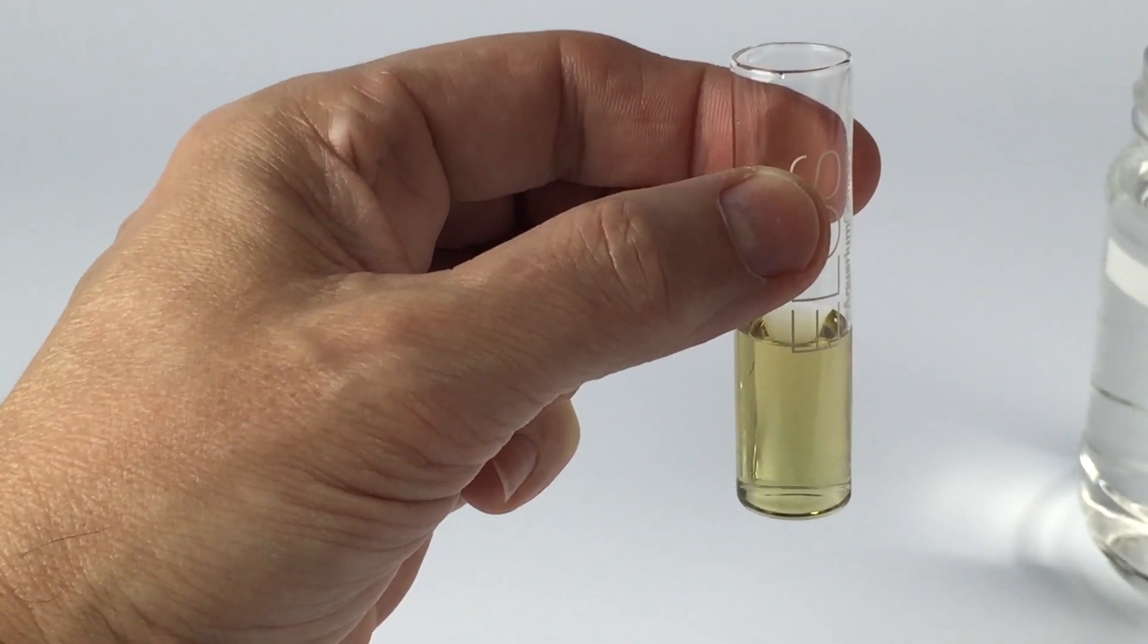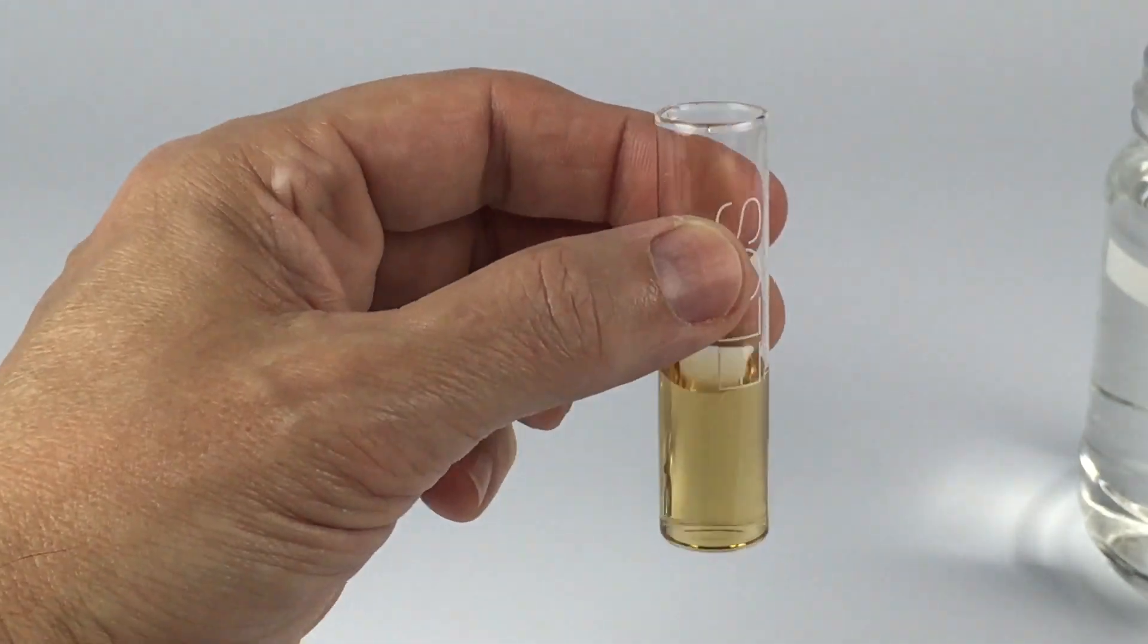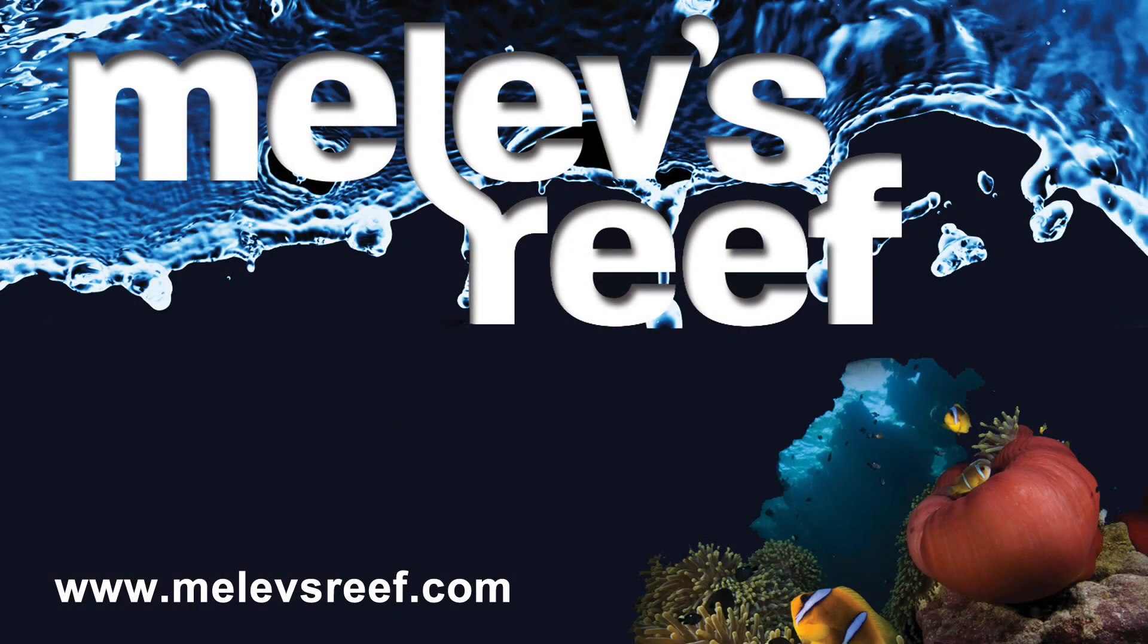Alkalinity is one test kit you cannot measure too often. You could do it daily, you should absolutely do it weekly. And once done always rinse out your vial with RO water and set it aside until next time.